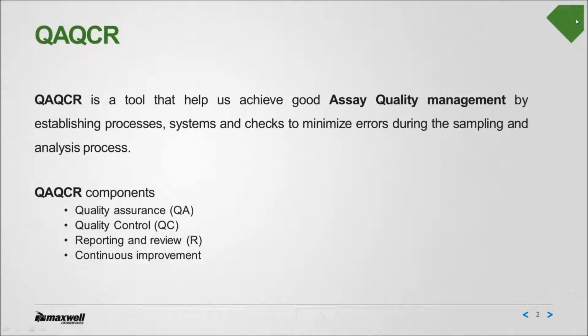To begin with, QAQCR is a tool that helps achieve good assay quality management, and that is by establishing processes, systems, and checks to minimize errors during the sampling and analysis process. So our main errors arise from sampling and also in the process of analyzing it.